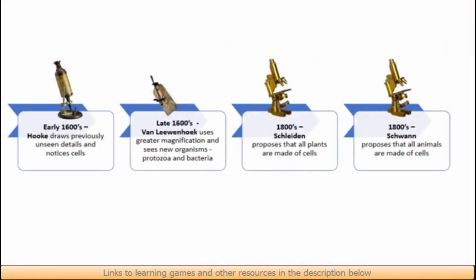Most of the significant advances in our knowledge of cells have depended on the resolving power of the instruments we use for magnifying these tiny objects. The resolving power of an instrument is the distance separating 2 objects that allows them to be seen as 2 distinct things rather than a single object.